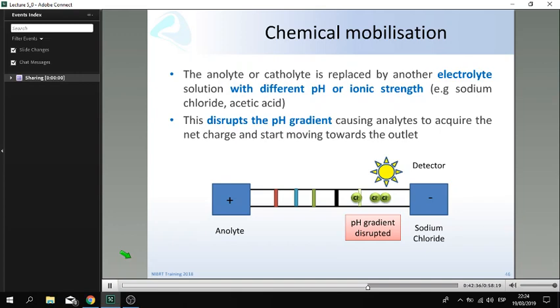It's not really the pump use, you're just pressurizing your reservoir to push something through. What pressure range really depends on the system, and it really depends on the method, so I wouldn't be able to give you one number, but I can show you when you are in NIBRT, for example, some of the examples of some of our methods. But as I said, they would really vary on the system that you have.